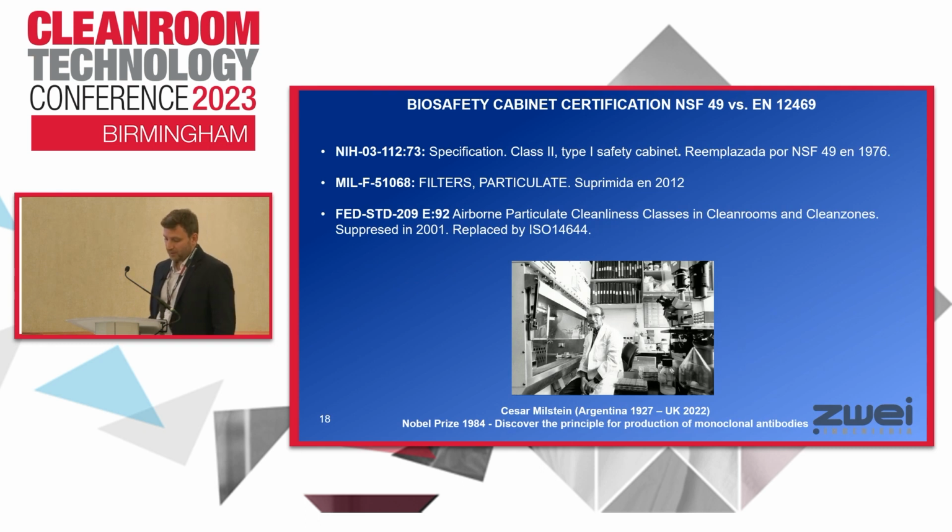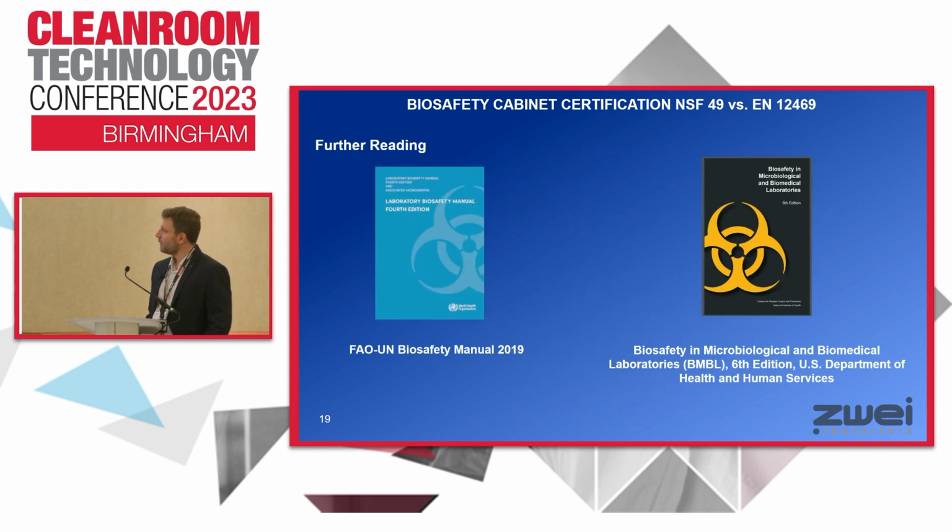Some regulations are usually mentioned in Spain and Latin America when the annual service is required by the user, but these standards were suppressed or replaced. Some literature is directly related to biosafety cabinets and laboratory biosafety. This book has very important information to keep in mind when we are working in a lab, and especially in this case, information about how to test and install a biosafety cabinet.